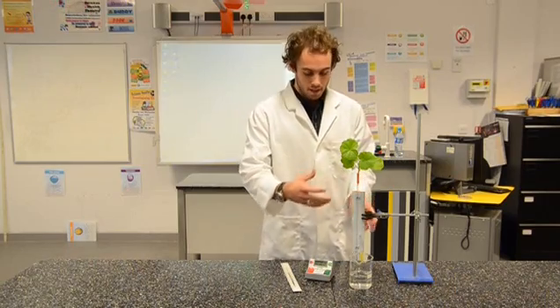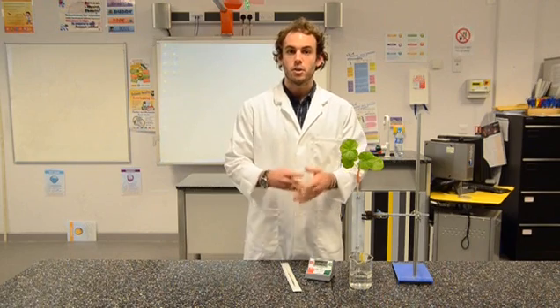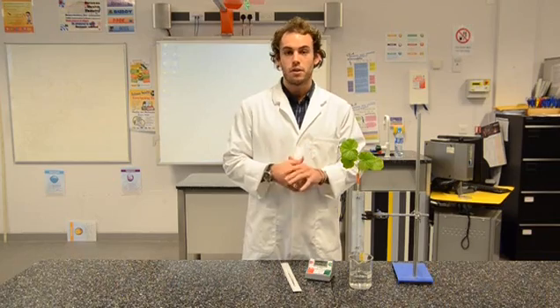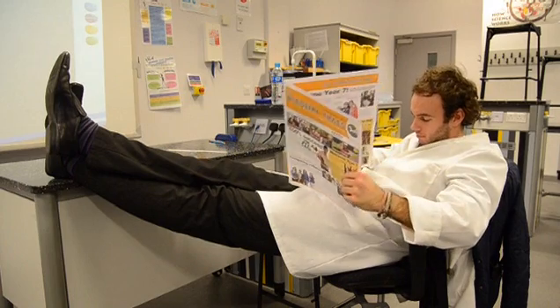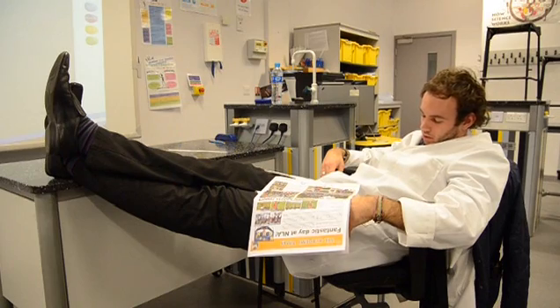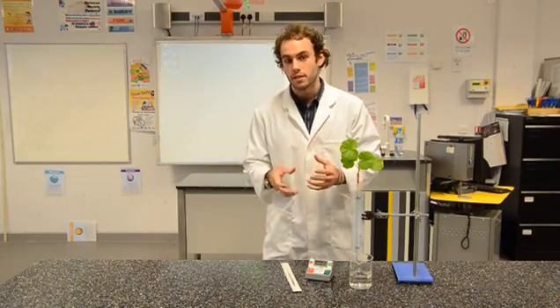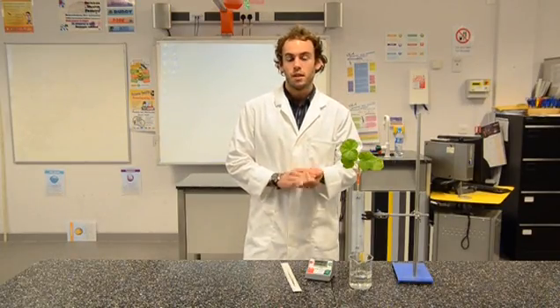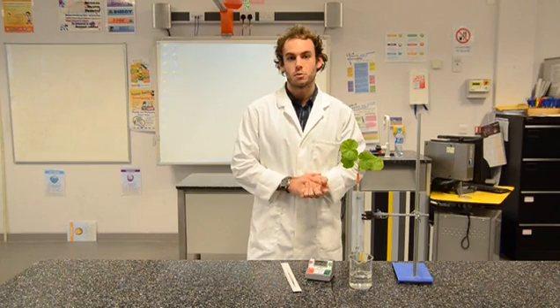Connect the apparatus to the clamp and submerge that in water. Now before you start recording any data, you want to leave the apparatus for 5 minutes to allow an air bubble to form inside the capillary tube. Then leave it for a further 5 or 10 minutes depending on how much time you've got in class, and measure the distance moved by the air bubble inside the capillary tube. Dividing this distance by the allotted time will allow you to calculate your rate of transpiration.